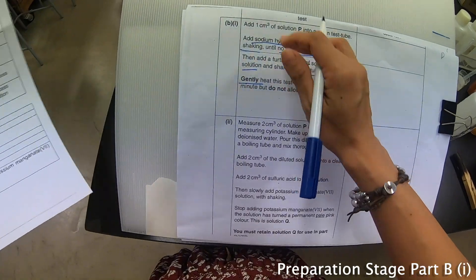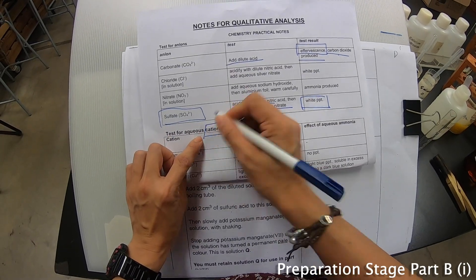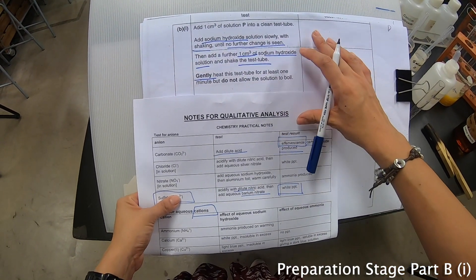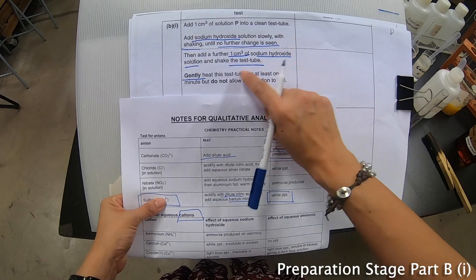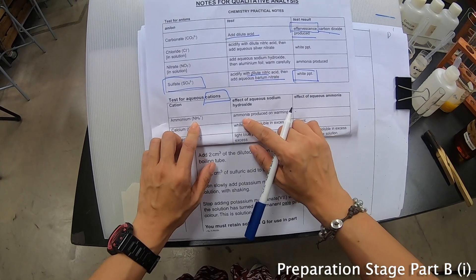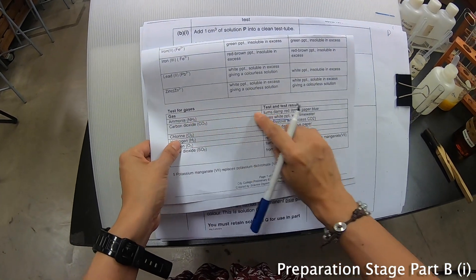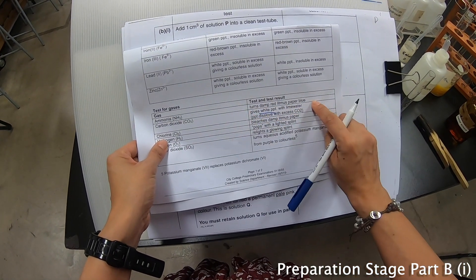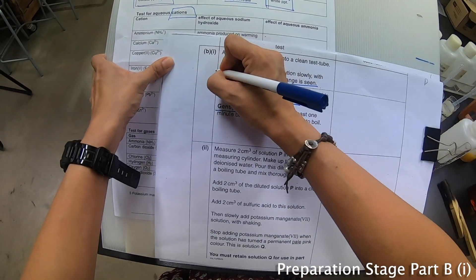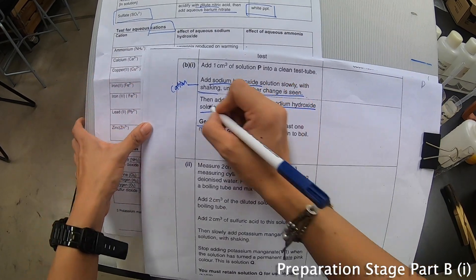Every time when sodium hydroxide is used you are testing for the presence of cations. There are two main parts here: one portion is just adding sodium hydroxide, and the second part is that you actually heat it. Heating is a test for ammonium — if ammonia gas evolves, ammonium is present. To test for ammonia gas you use a damp red litmus paper. So remember: what you are testing is cations, and this one is the test for ammonium.